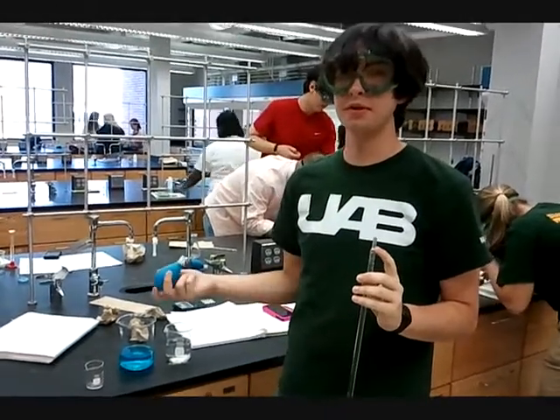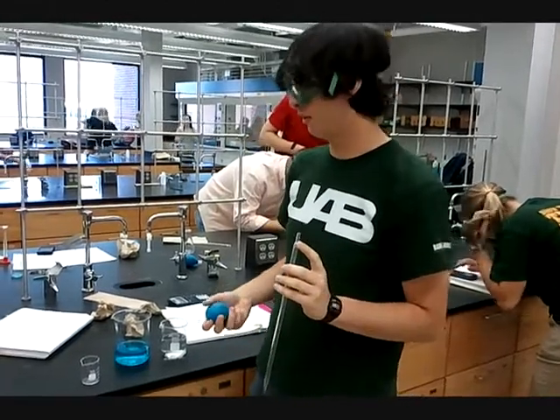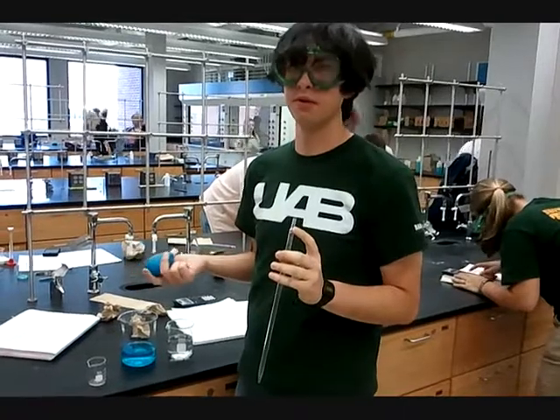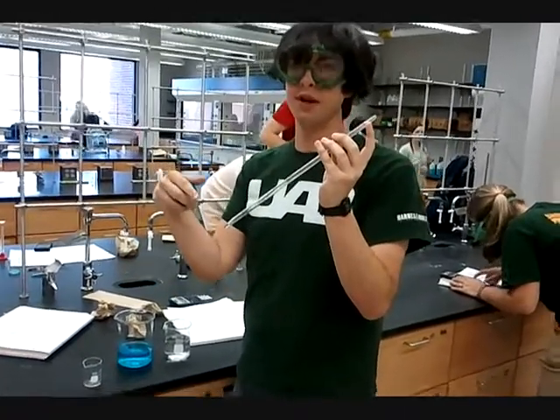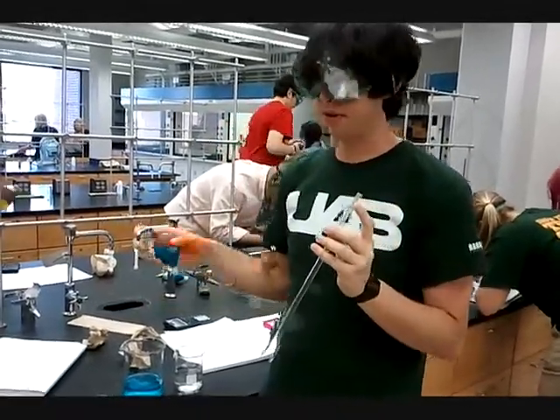Okay, so today we're doing the density graphing lab, and we're going to show you how to measure density using the mass and volume of a solution. First, you have to rinse the pipette out with water 3 times, and then rinse it out with the solution 3 times to get it cleaned out. And I'm going to show you how to measure with pipettes.